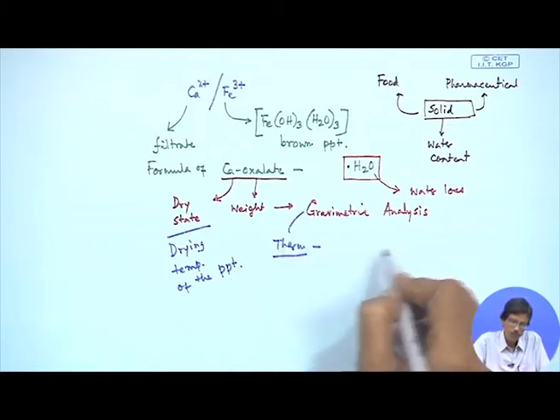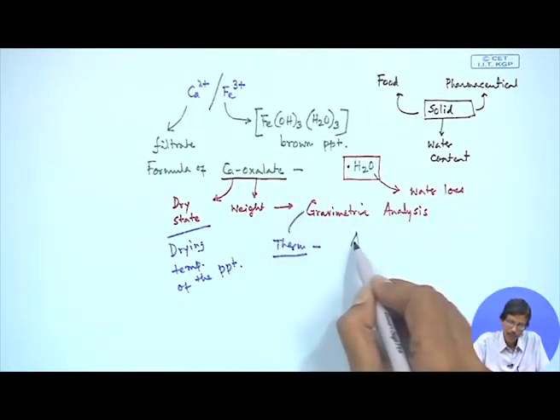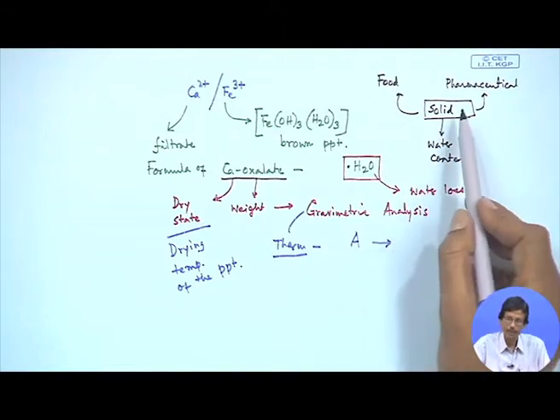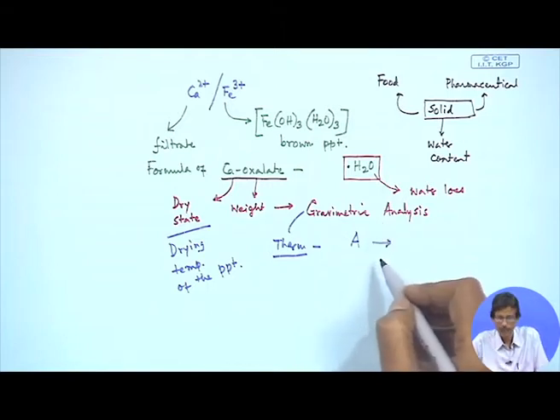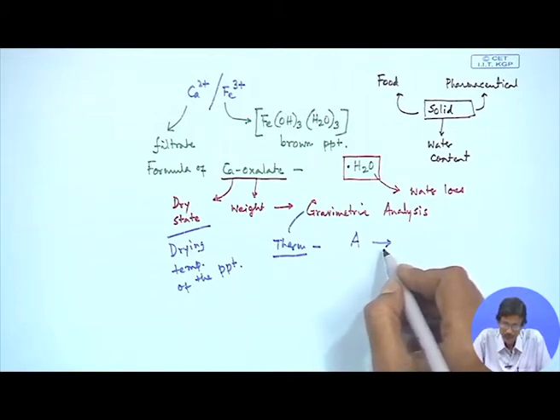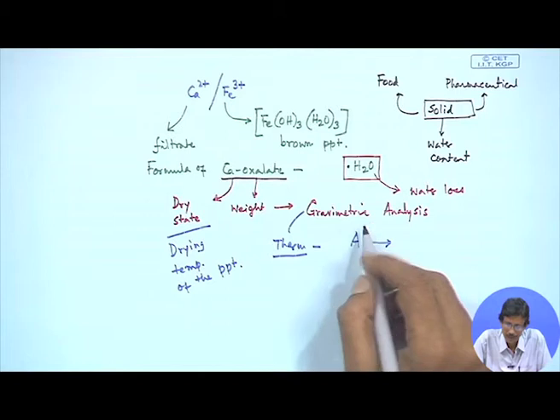So, that particular profile can also give you the species, that means the thermal stability of the calcium oxalate. So, any other thing, any polymeric sample, any cement sample, any ore or any solid or the pharmaceutical sample, we should know its corresponding thermal stability, because we have to keep that particular sample at a particular temperature. If it is unstable at room temperature or at a little bit higher temperature than that of our room temperature, we have to be very much careful about its thermal stability.